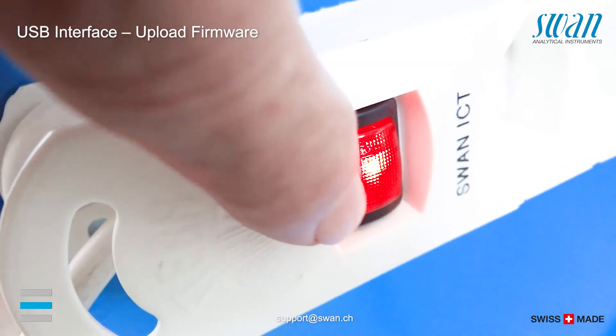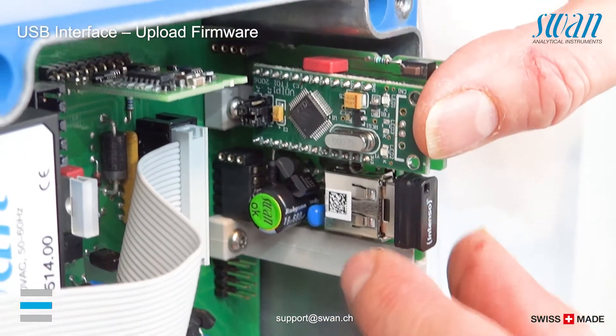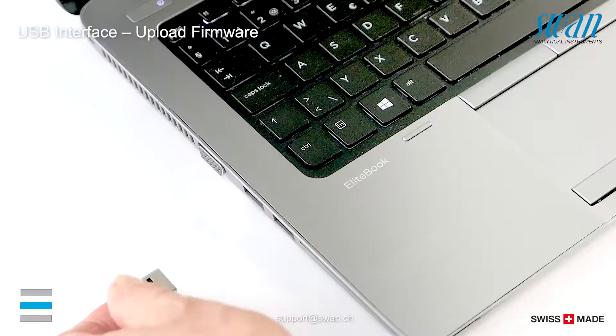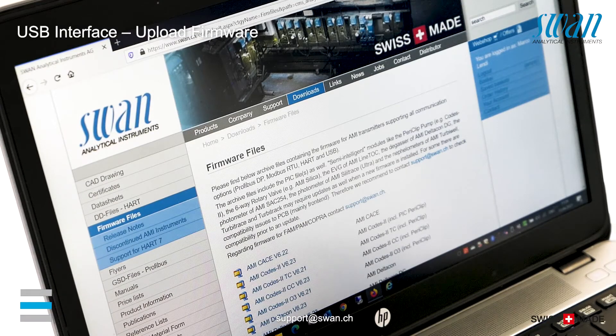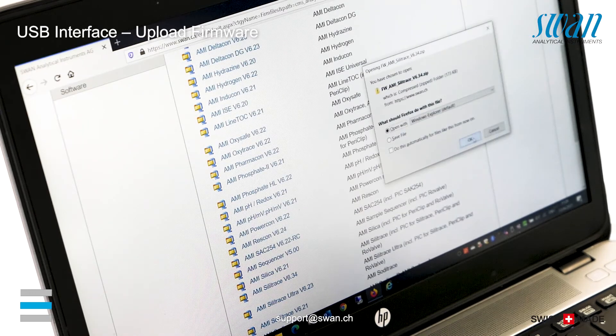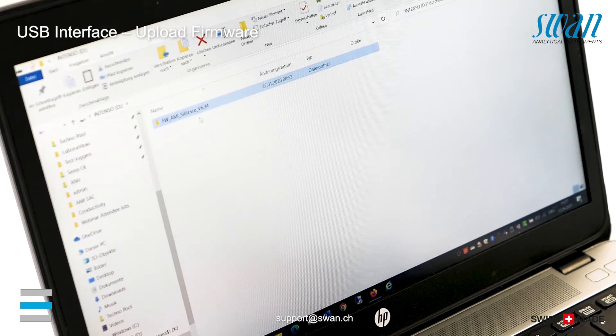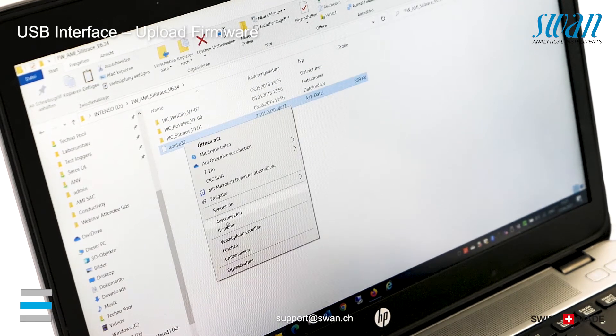Switch off the power and open the transmitter housing. Insert the USB stick into the socket of the notebook or PC. Copy all firmware files you need to the root directory of the USB stick.